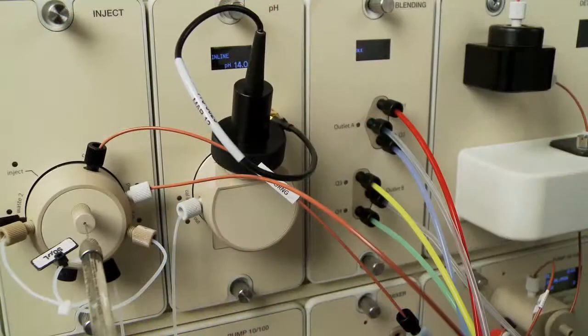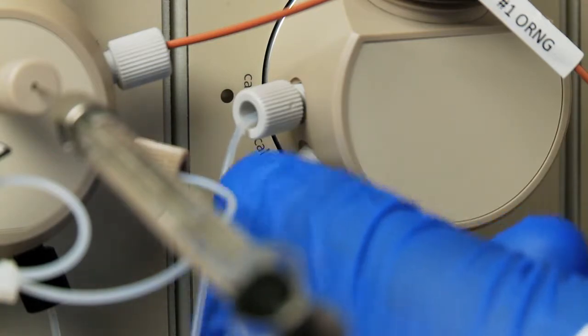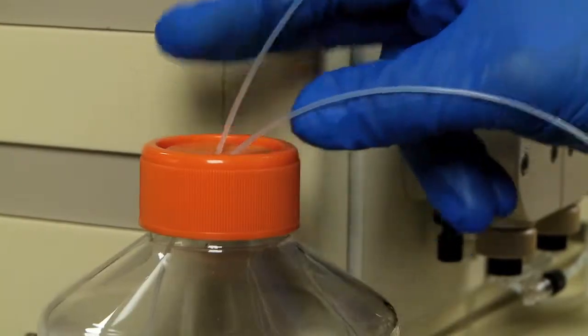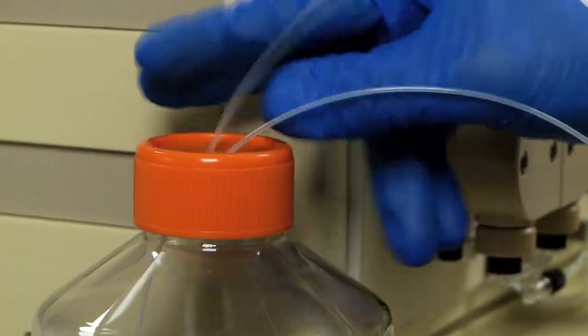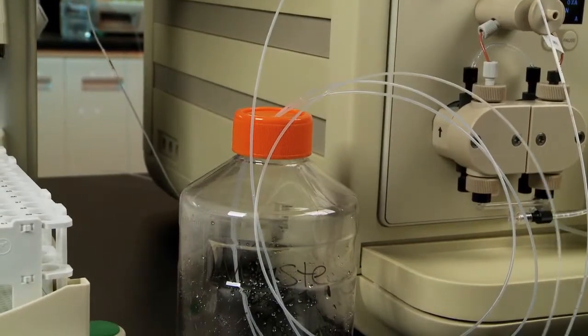Connect the waste tubing to the calibration waste port labeled CAL OUT on the pH valve and immerse the open end into a waste container. The waste container should be placed next to or below the NGC. Do not place the waste container on top of the NGC.